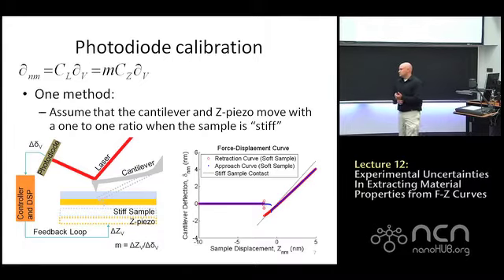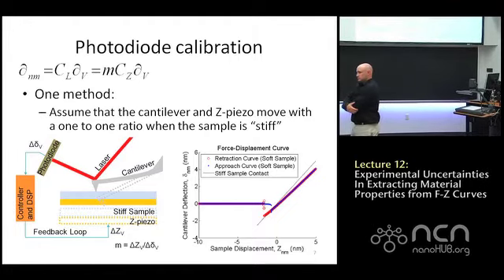Delta, you defined it on the first slide. Yes. In your equation, is delta CV the same as delta ZV from the piezo calibration, the CZ term? Yeah, it's the same.